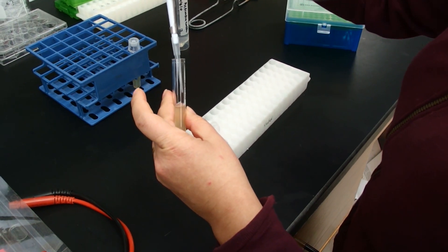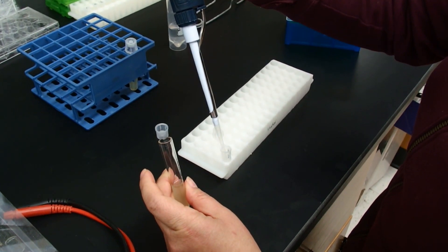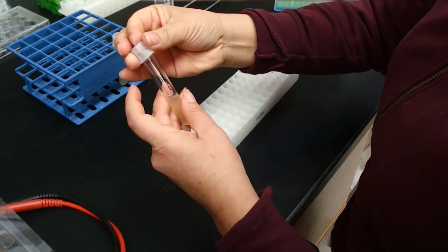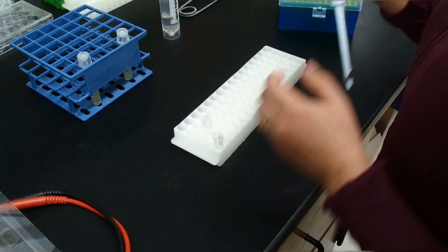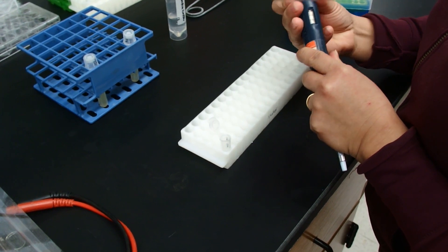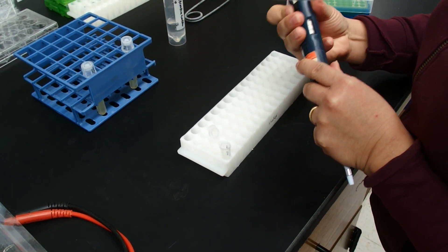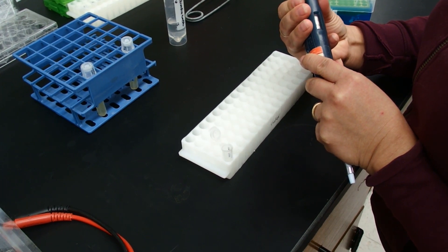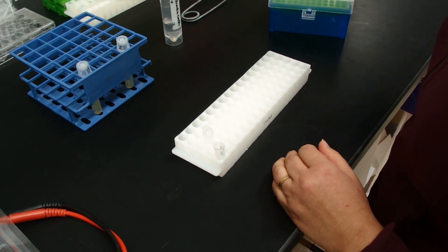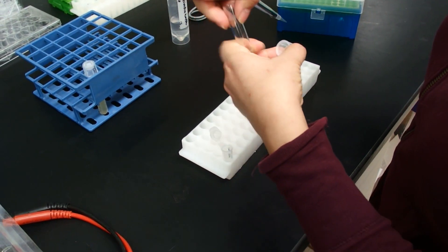I am going to transfer the calculated amount of bacteria culture into this tube. First, the culture containing my gene of interest — 119 microliters. Now 56 microliters of the culture containing P19. Those numbers are based on calculating from the formula in the protocol and the OD600.